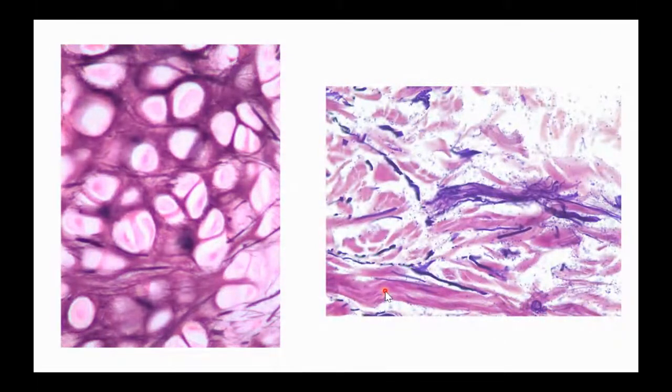Let's talk about my types of tissue that have purple in them. Here's something I want you to write down. This is another underline, highlight, star idea. Whenever you see purple, you should be thinking elastic. You should be thinking elastic. So anytime you see purple, we are thinking elastic proteins.